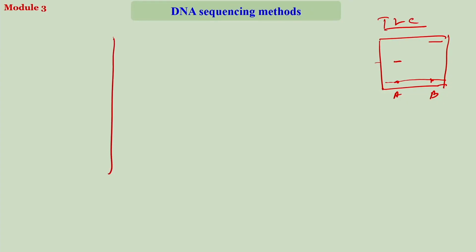It is also a kind of chromatography, but this is called gel electrophoresis. It is also known as autoradiogram.